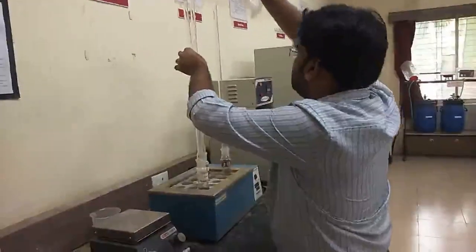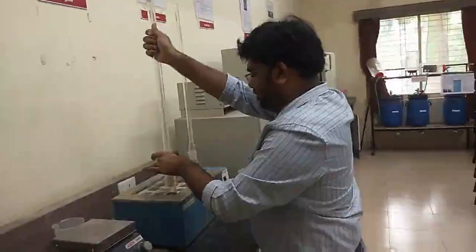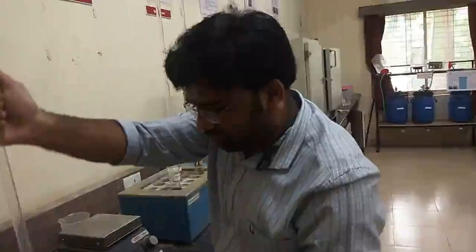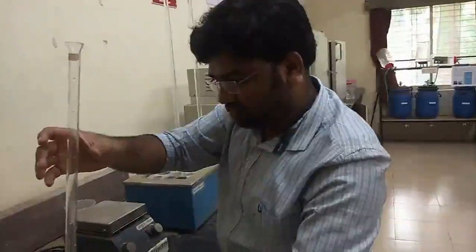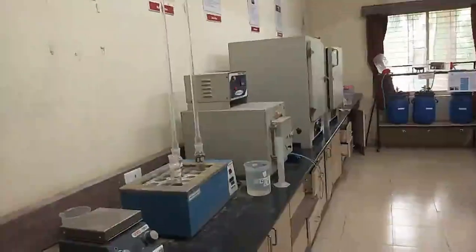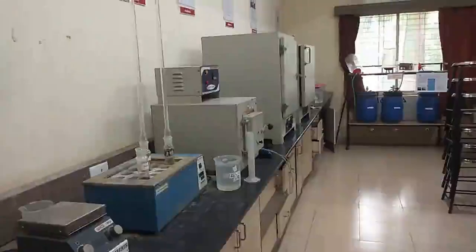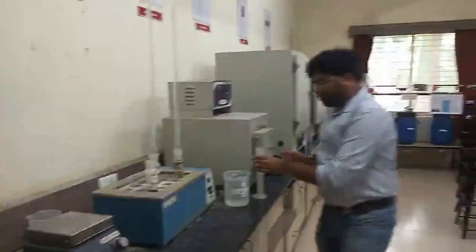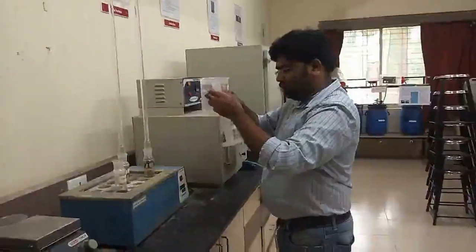I've added 20 ml distilled water, so I'll be removing the reflux condenser to avoid confusion, and I will be putting it directly into this tank. The same process is to be repeated for the other two, 20 ml each.